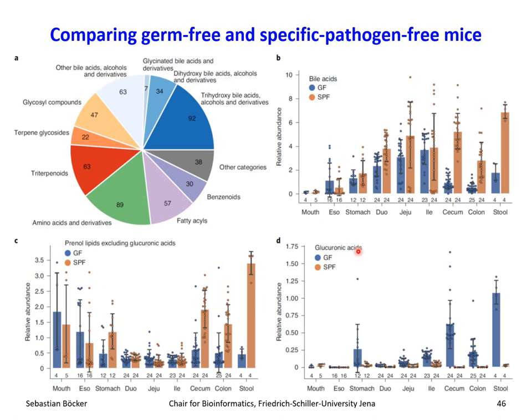These are all the ones that show a fold change larger than tenfold between the samples. Again, we can't really tell you what those glycosyl compounds are, because they have not been annotated, they have not been identified. The only thing we can tell you is there is a glycosyl compound and it's up or down regulated. Potentially enough information for the next analysis step.